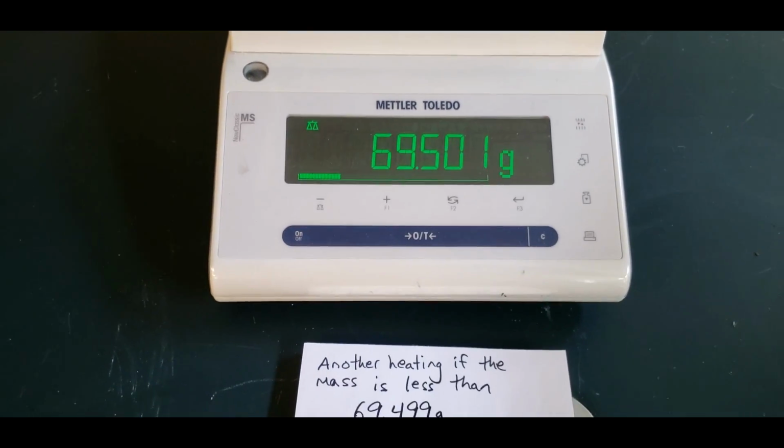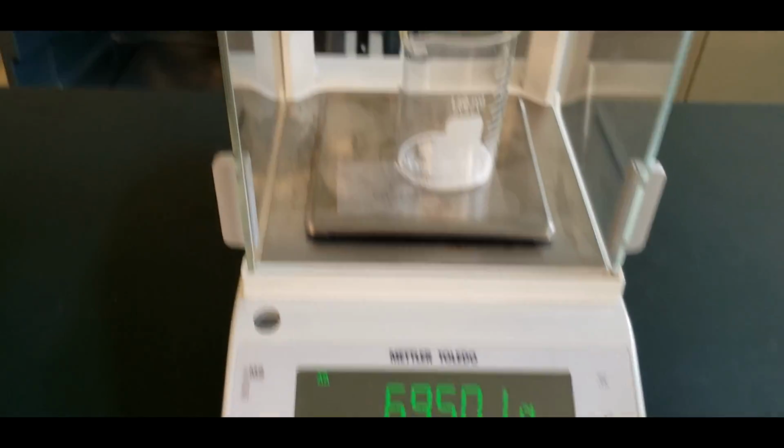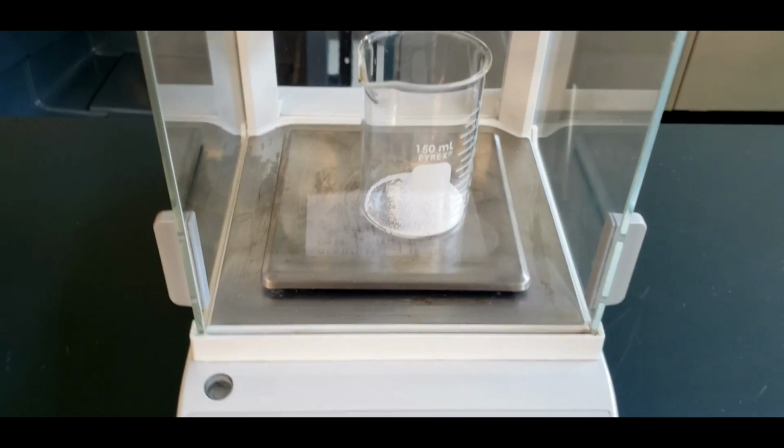69.501. Awesome. So that's it. That's our second heating, and that's the last one we have to do. We're going to assume that in that sample is only salt and sand, and we can go on to the next step.